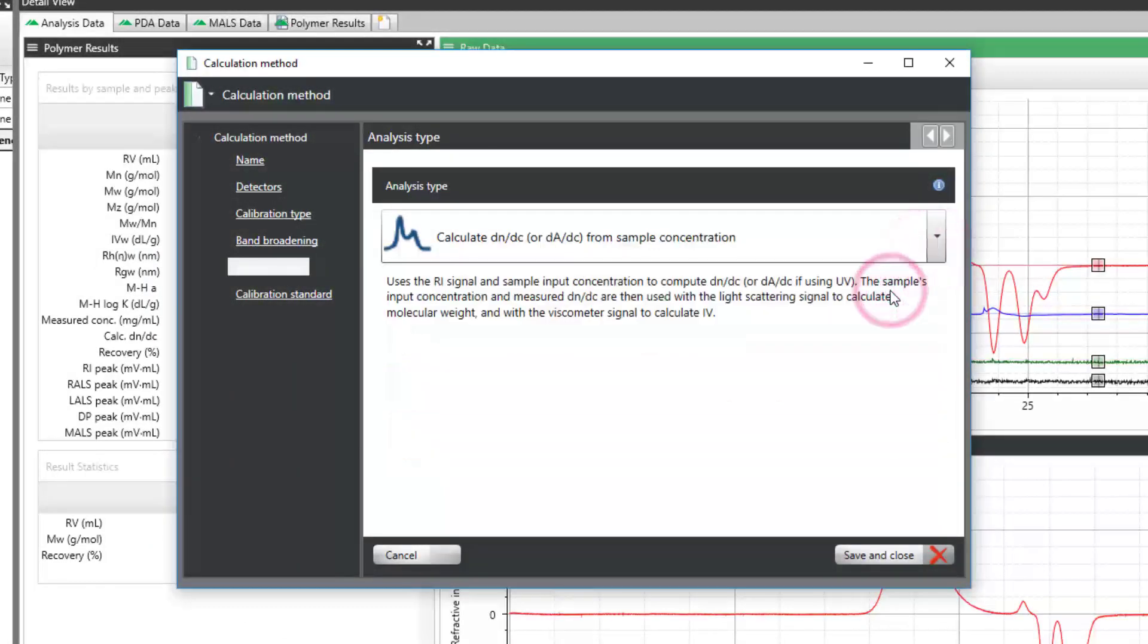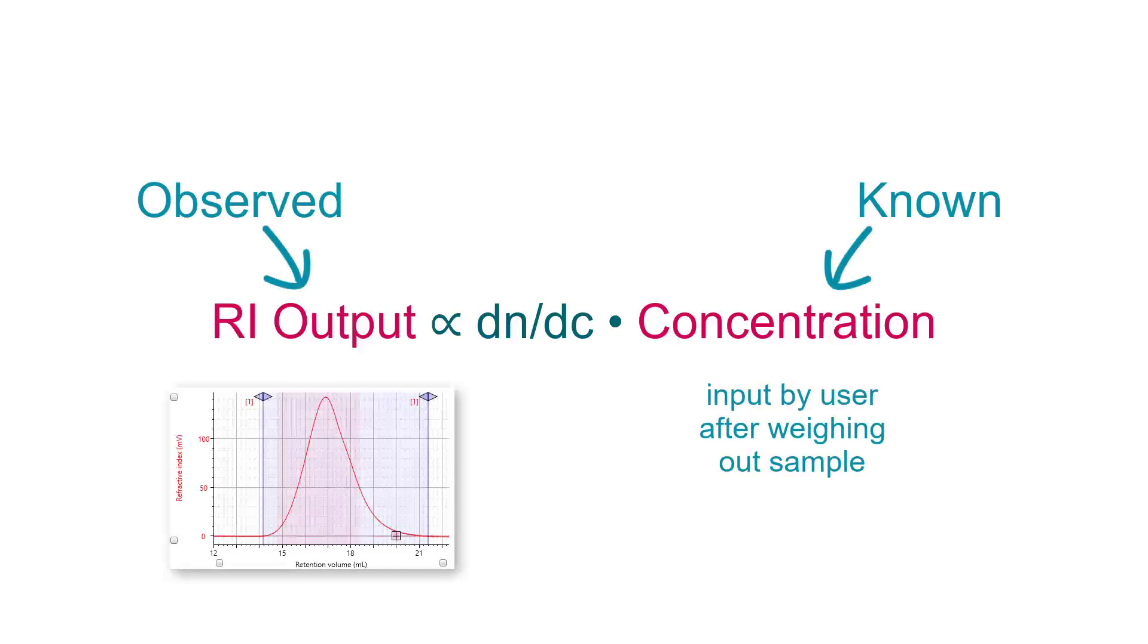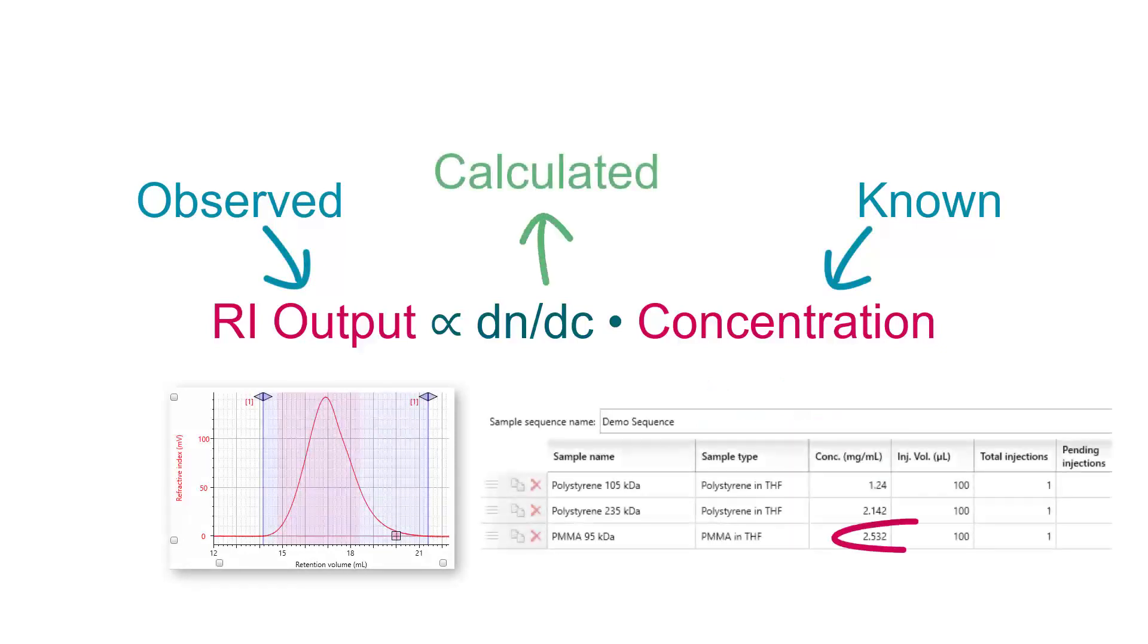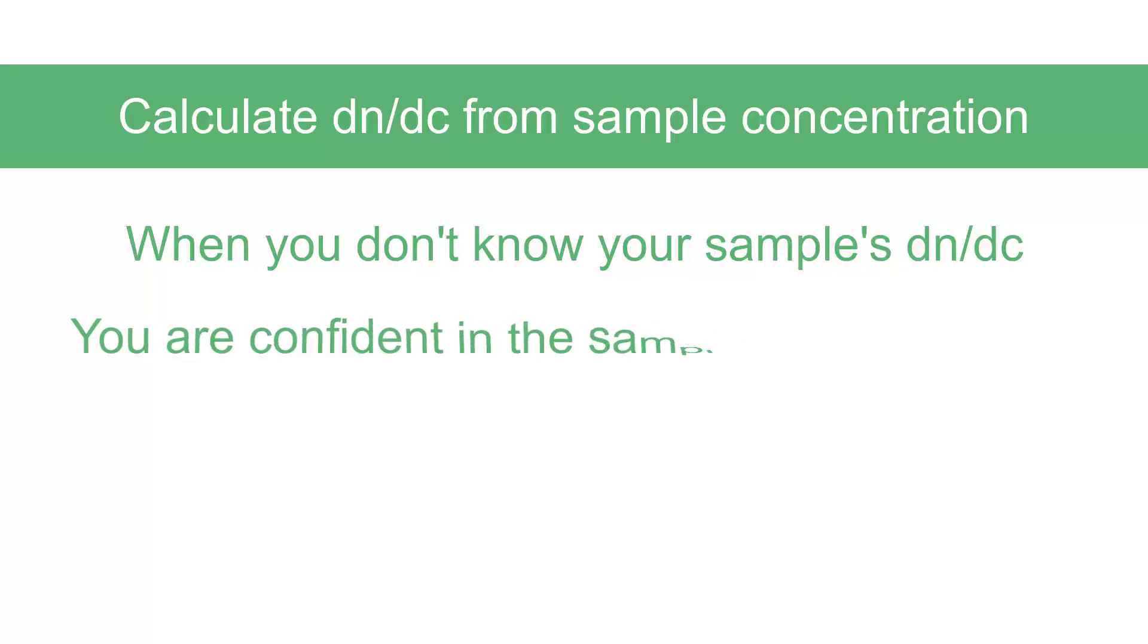The first, Calculate DNDC from Sample Concentration, assumes a 100% quantitative recovery of the sample to determine the DNDC value. The software accepts that the total amount of sample injected, based on the input concentration and injection volume, is responsible for the entire refractive index response designated by the limits and baseline. The DNDC value can then be determined and used in subsequent molecular calculations. This method works well if you don't have an established DNDC value for your sample and you are confident in the sample's concentration.